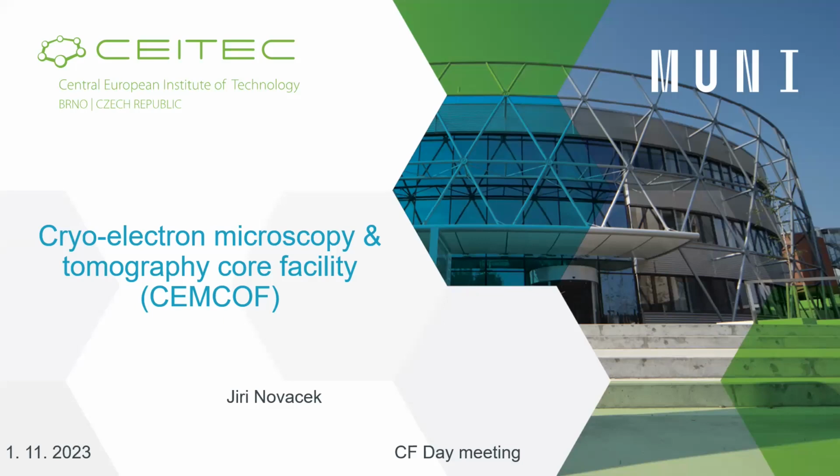The situation is a bit more complicated in life sciences, where we actually cannot observe individual atoms with electron microscopy, because before that we damage the sample with the electrons. However, we can get to a very high resolution, at the level of other high-resolution structural biology techniques. So electron microscopy fits into these techniques, such as NMR spectroscopy or X-ray diffraction.